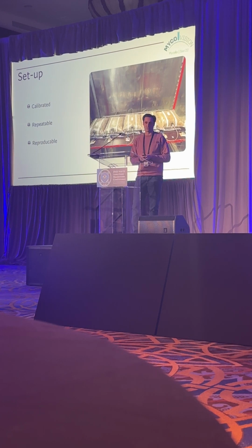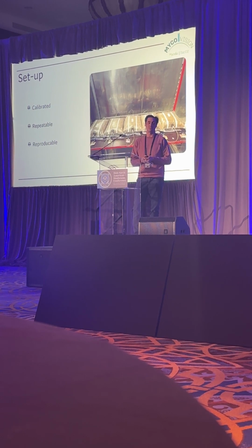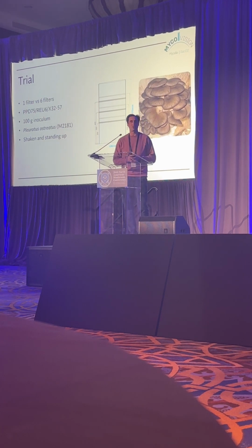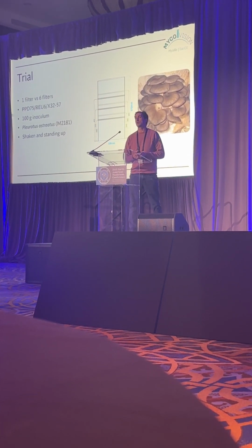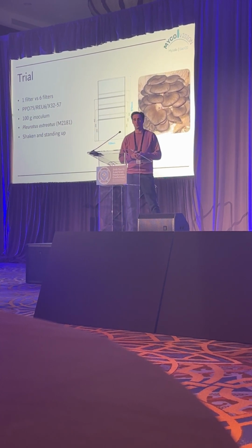This is what it looks like for in vivo trials. So we have the bags on a shelf, we hook them up to the machine with tubing, and then we can measure gas concentrations inside the bag. Okay, so about the trial, we try to find out what the influence is of restricted gas exchange on the carbon dioxide and oxygen levels in growing spawn.